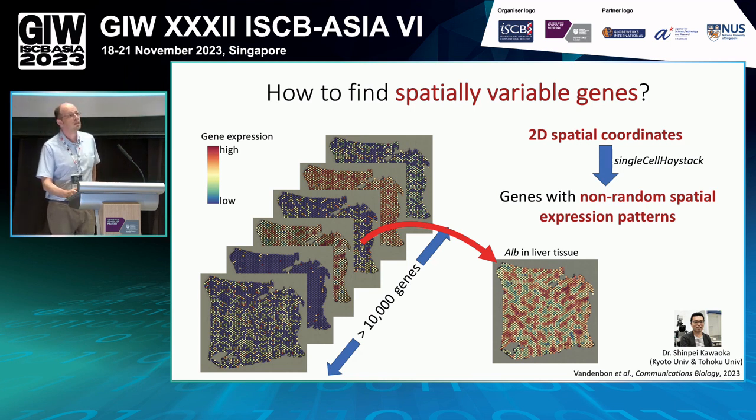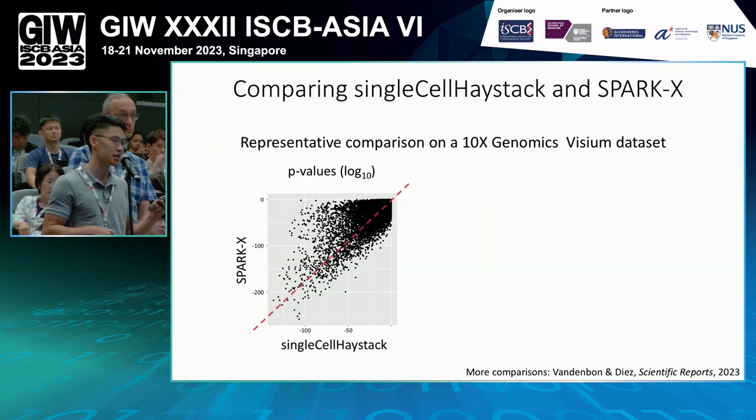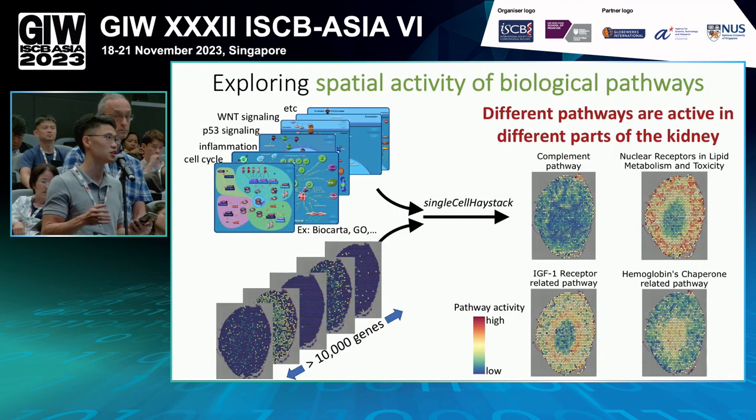Please, from the left side now. Okay, thank you for your work. I appreciate that we are able to call DEGs even though we are blinded to clusters. My question is, I may have missed it, but how did you choose the nodes? Because I believe that they will influence the reference distribution and eventually affect the DEG calling.